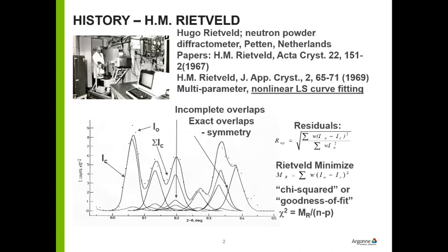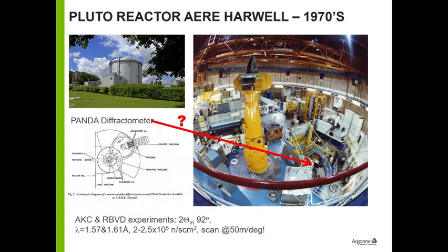Okay, let me see if I can get it to go to the next slide. Yes, here we go. Well, where did I start with this game?